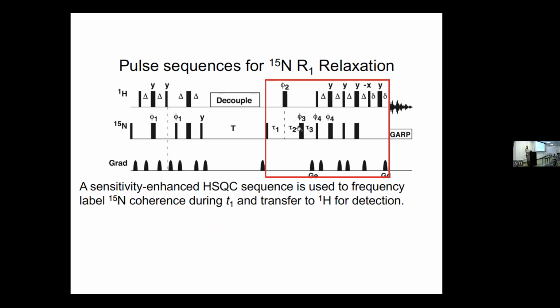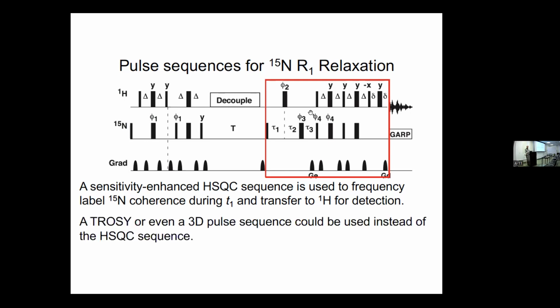And then as time goes on, the delays are both going to get longer and the positioning of the pulses will change. So we evolve the J coupling for an effective time 1 over 2J, and evolve the chemical shifts for an effective time T1. And I don't know if I have the numbers in the notes for that calculation.